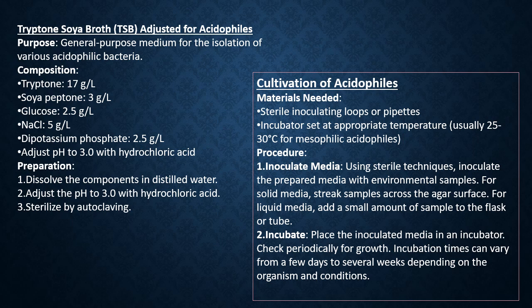As here we are just targeting acidic microbes, the chances are your sample will not be too crowded, so no need for too much serial dilution. Even for soil samples or sediments, you can proceed with serial dilution. You can pipette out the last two serial dilutions, and then you can spread plate them or pour plate. You can do streaking, pour plate, spread plate, anything that you're okay with, and then you incubate your plates.